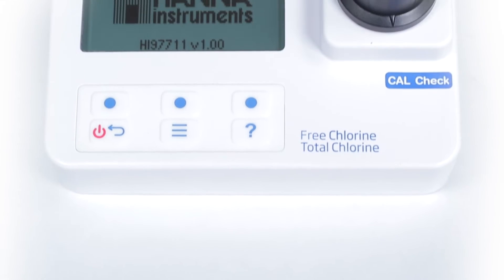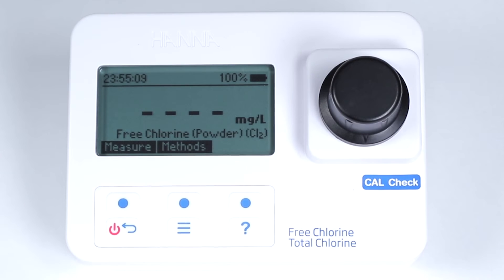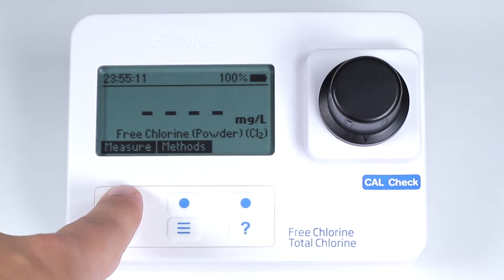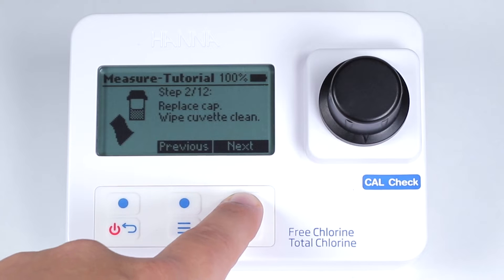The HI97711 has a large backlit LCD that allows for easy viewing under any light conditions. The use of a dot matrix display allows for an intuitive interface in the operation of the meter, including a tutorial mode that will guide a new user step-by-step through the measurement process.